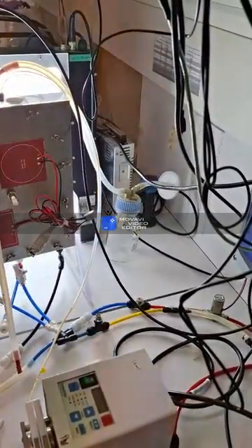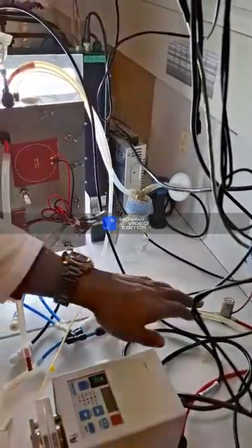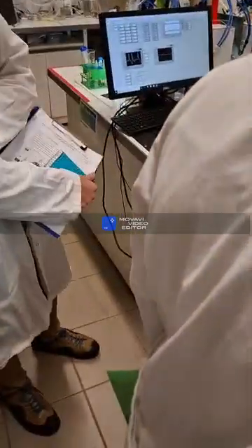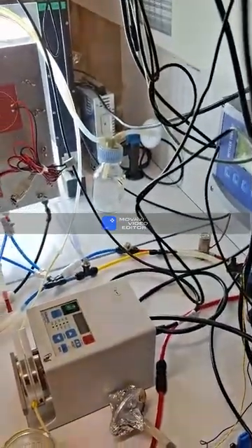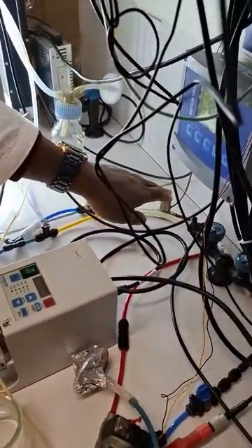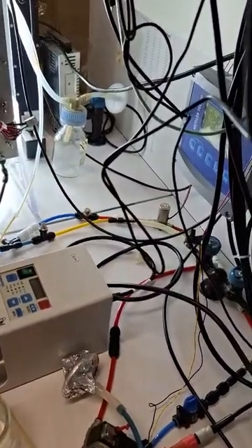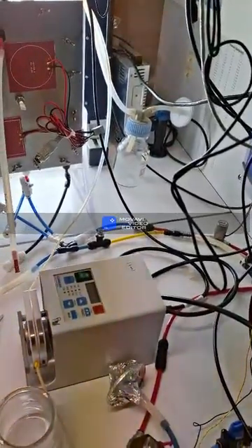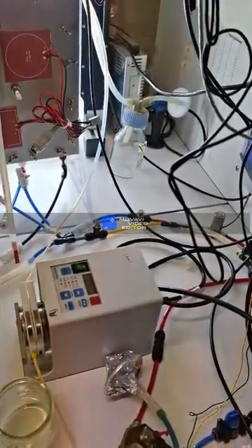Yeah, but it will be regulated by the pH probe and the electro valve, because we will put here in this value, you will have it in your documents, it's 7.5. So you will put 7.5, and when you are above 7.5, you will have an opening of the electro valve, which will inject carbonic gas inside, and when we reach 7.4, for example, it will stop.